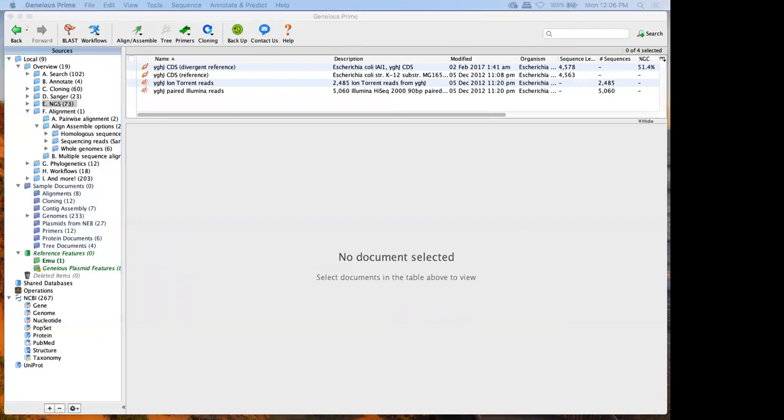If there are no questions, the next thing we're going to talk about is NGS data. Like I said, Geneious works with NGS or with Sanger sequencing. We're going to go through an example with some NGS data. A lot of what we're doing would actually apply to Sanger sequencing though, so if you're working with Sanger data, you'll still get a general idea from this.